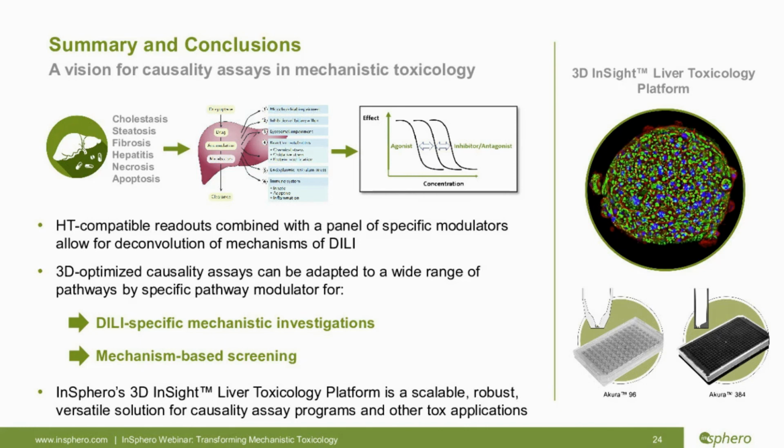So at the end of the day, by the choice of the model, together with the platform, the endpoints, and in case of the causality assays, also the pathway modulator, one can build up a recipe for a scalable mechanistic investigation.